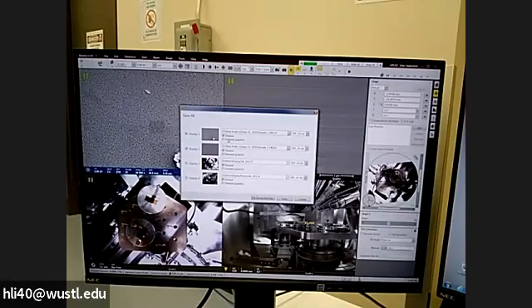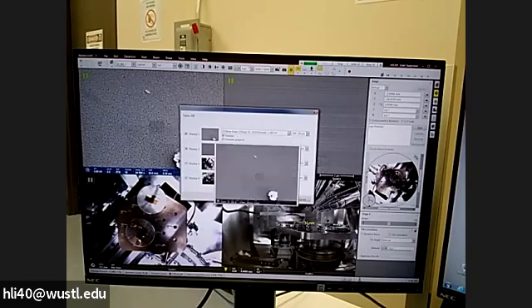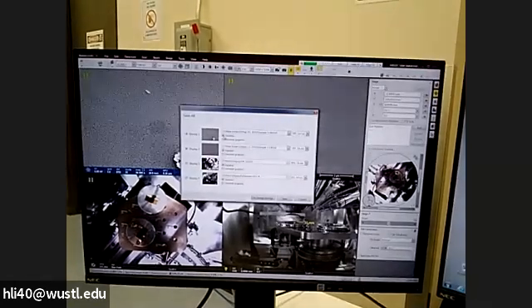The next thing is you really should check the data bar. If there is no data bar, you will not be able to see this information. Even though it will be saved with your data, you will not be able to see it on the image. So it really depends. Some people don't like it. You can save both.